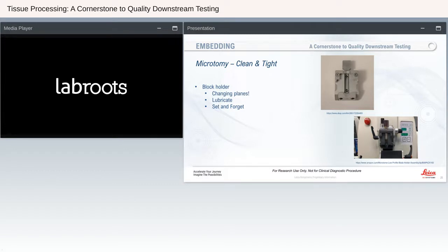Moving on to microtomy. The first thing I'd like to talk about with microtomy is the chuck holder. Make sure it's clean and tight. Usually they're very simple, as you can see in the image at the top, or a little bit more complex on the bottom right. Want to be sure that once you have it set to a zero plane, you just set it and forget it.